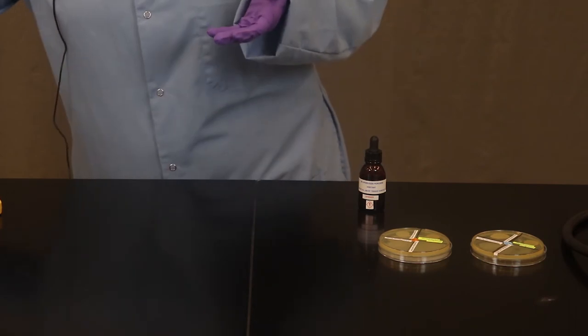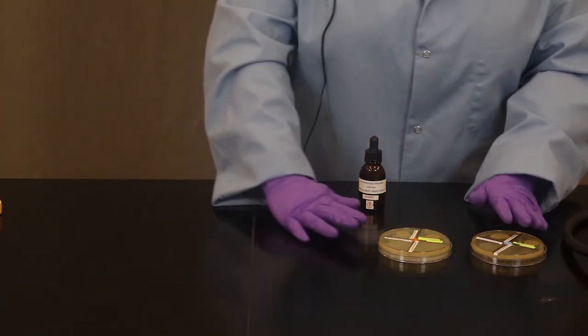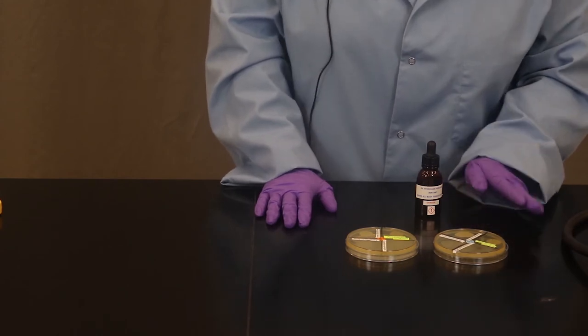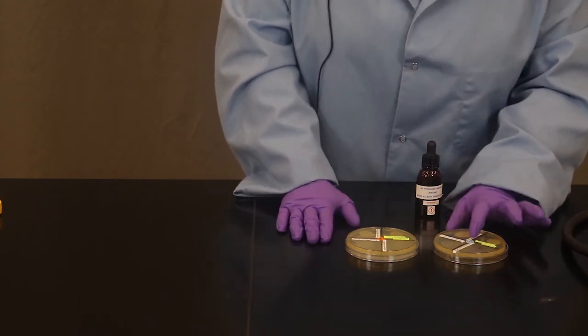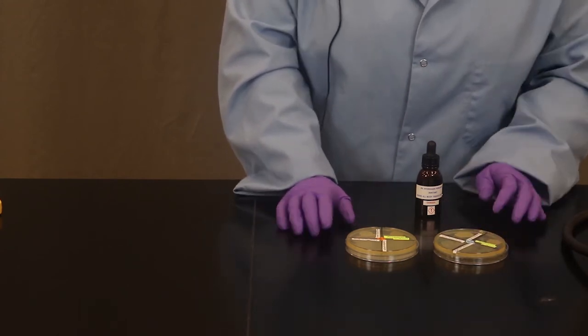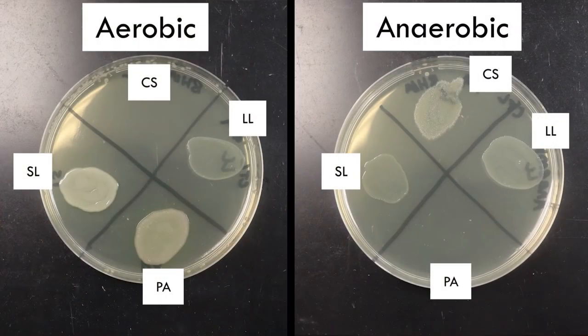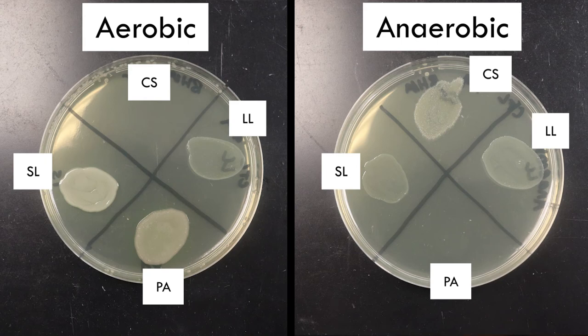Notice these have been labeled a little bit differently from the initial demo. These were ready for us to show you in terms of demonstration. So what we can see here is one plate is labeled O2. One does not have any oxygen. And you can kind of see the spot inoculations here. We'll show you formal pictures in D2L as well. But you can see the spots where the bacteria are growing or not growing.